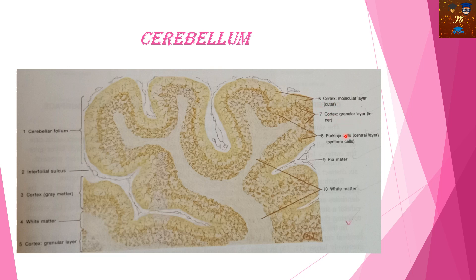The gray matter contains different types of cells. You can see the molecular layer, which contains molecular cells, and the granular layer is also present. These dark spots are the Purkinje cells, which are considered the main cells present in the cerebellum. Cerebellum is identified by these folds containing different layers — the molecular layer, granular layer, and Purkinje cell layer of different colors.